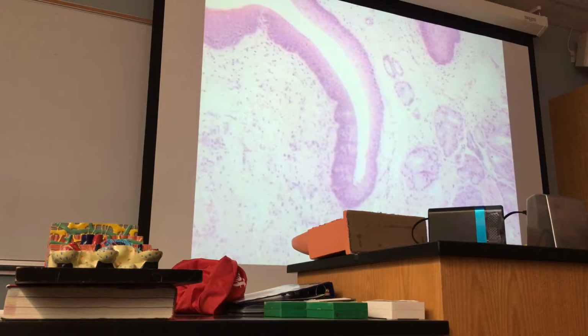How do you know it's the tongue? It's the tongue because of the taste buds. Taste buds can only be present in the tongue. It cannot be present in the stomach or in the pancreas unless some mad scientist grafted something intentionally to confuse the students. I'm just kidding. So by this circumvallate or vallate papilla, you know that this is from the tongue. Good enough for tongue identification.